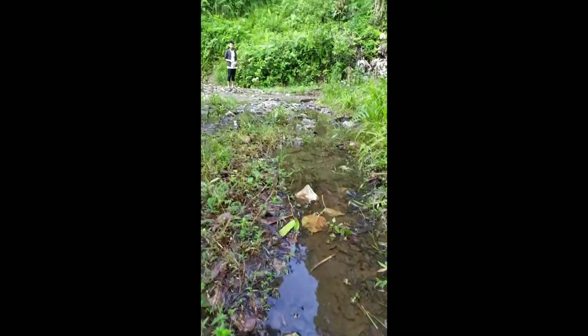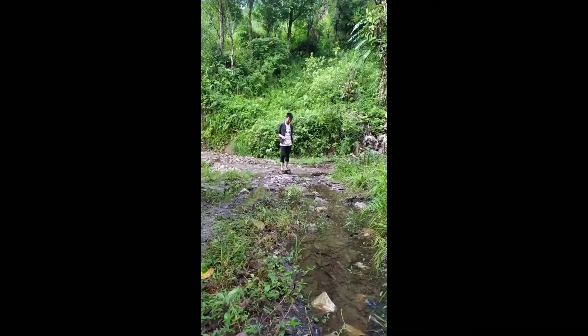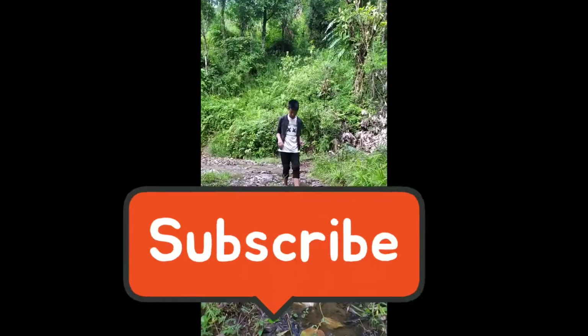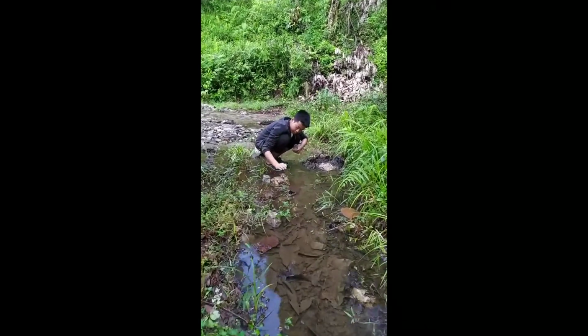So friends, this is the site where I'm going to collect the water sample. It is actually not a pond but a small puddle or a still water area near a riverside. The water is stagnant over here, so I'm going to collect the water samples from here.